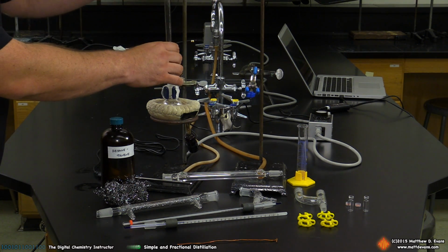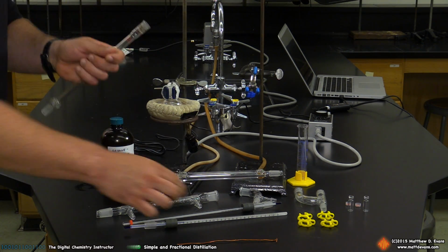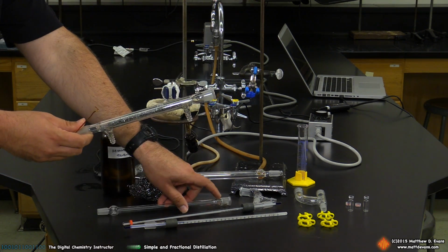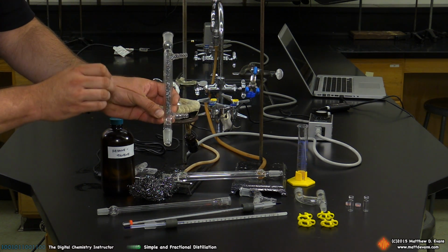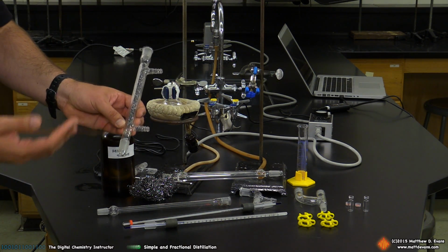Now, the way to stuff this column with the steel wool is just to take little bits at a time of the steel wool and kind of ram it gently inside this fractionating column. I've already done this ahead of time. This is not a true fractionating column, but it still works. You can see I've already stuffed this column with steel wool, such that you don't want it real tight in here. You just kind of want it to go from the bottom to the top. That's a good setup. And again, this is for fractional distillation.